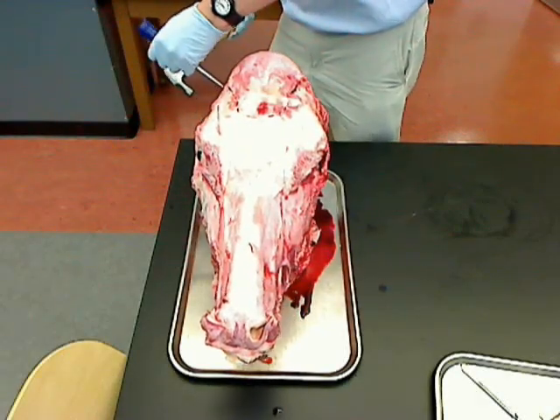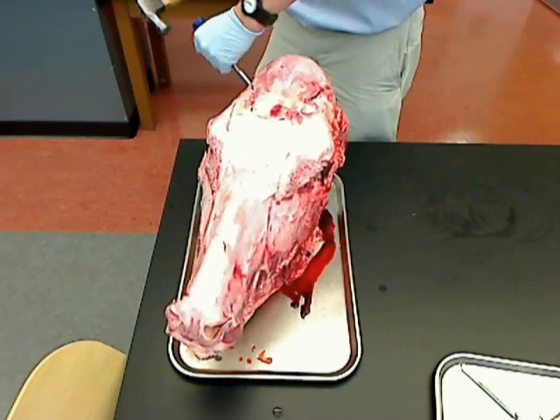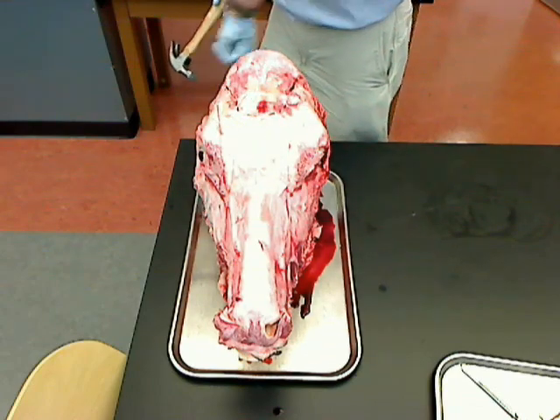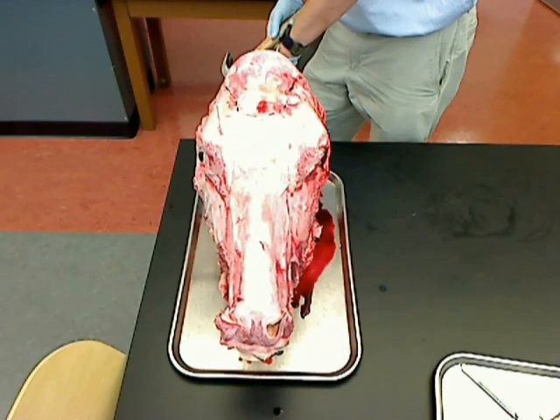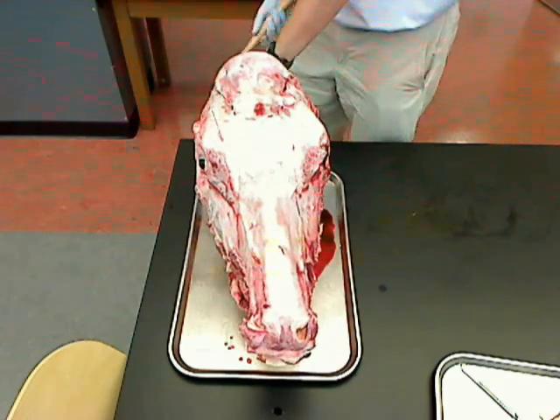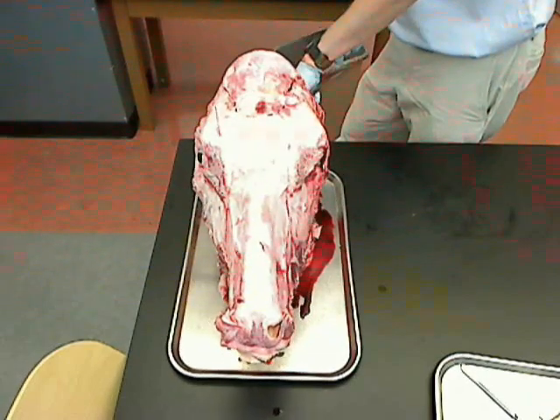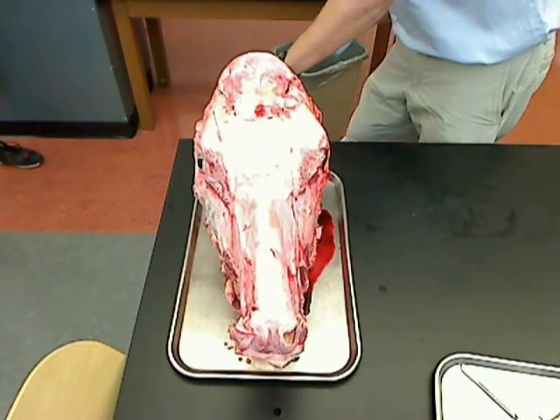One of the things I overlooked the first time I did this was that the brain comes down and over the back here. In fact, I showed you where the spinal cord was in the back here. So I need to follow up on either side of that in the back.